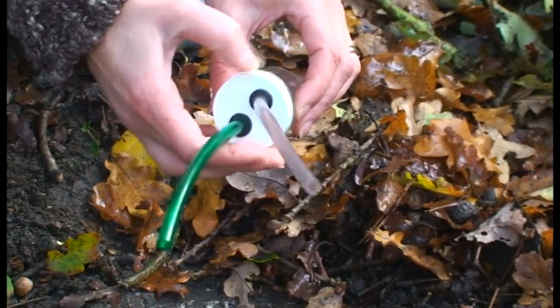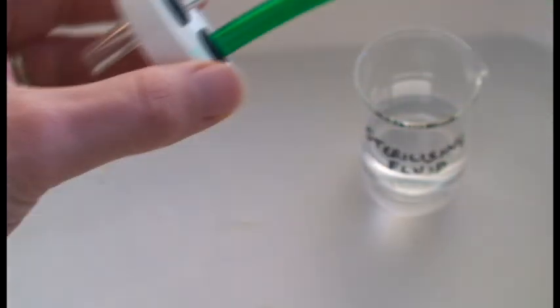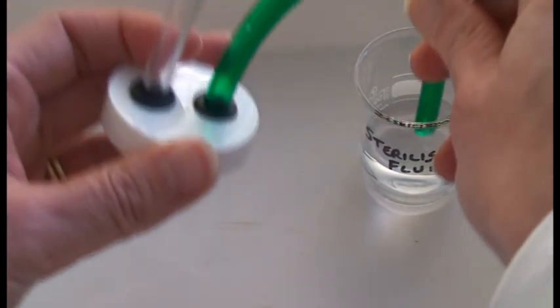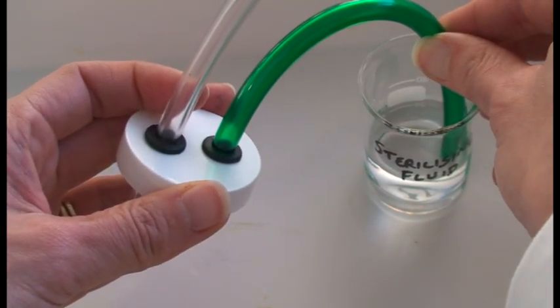Remember to return your mini-beast to its natural habitat as soon as possible after collection. Then return the pooter and sterilise the mouthpiece section ready for the next person.